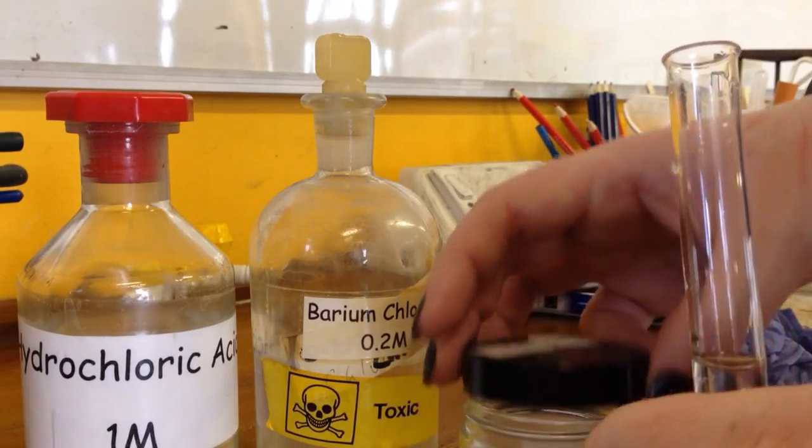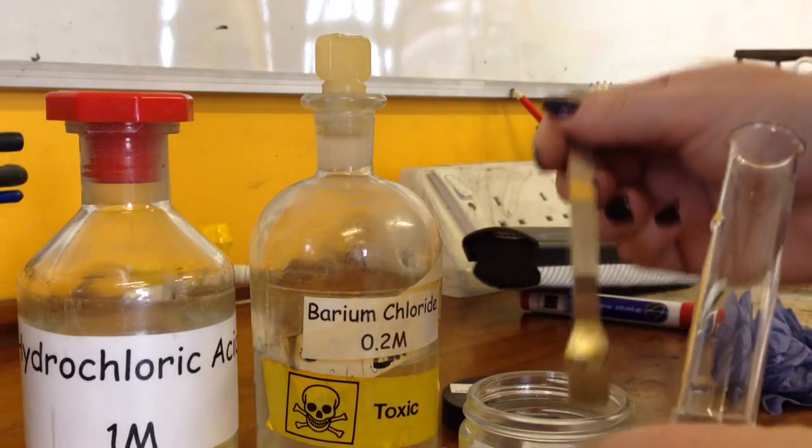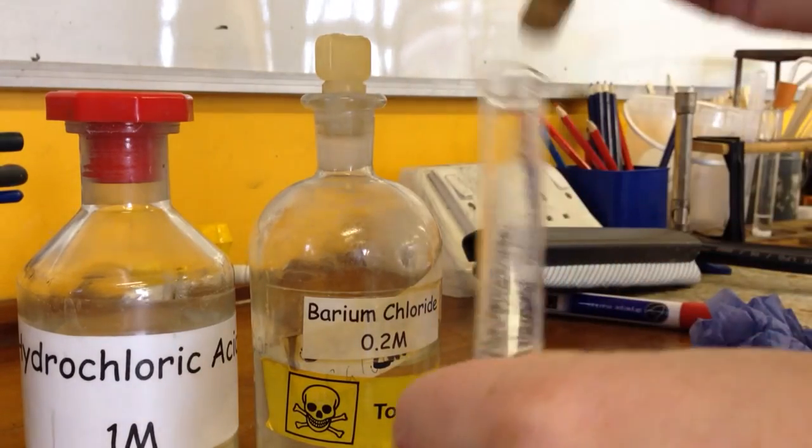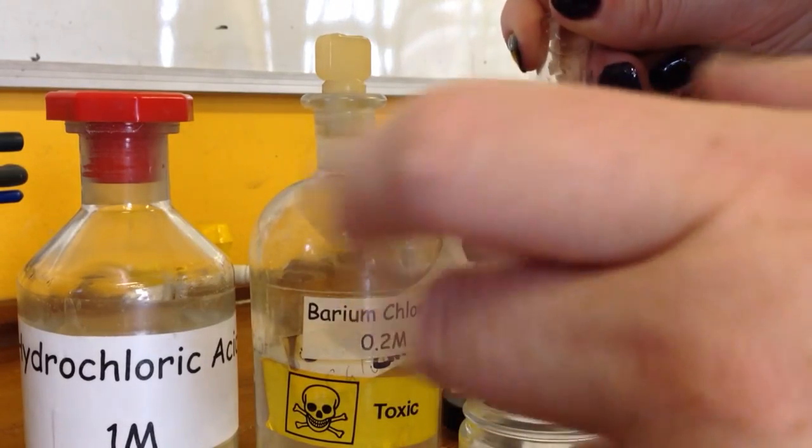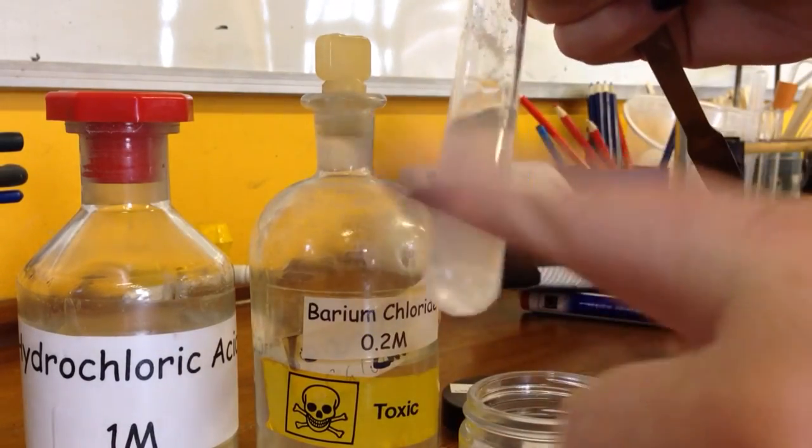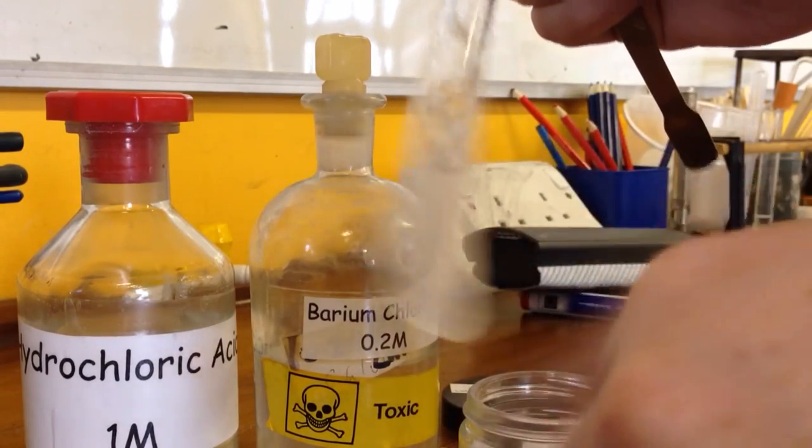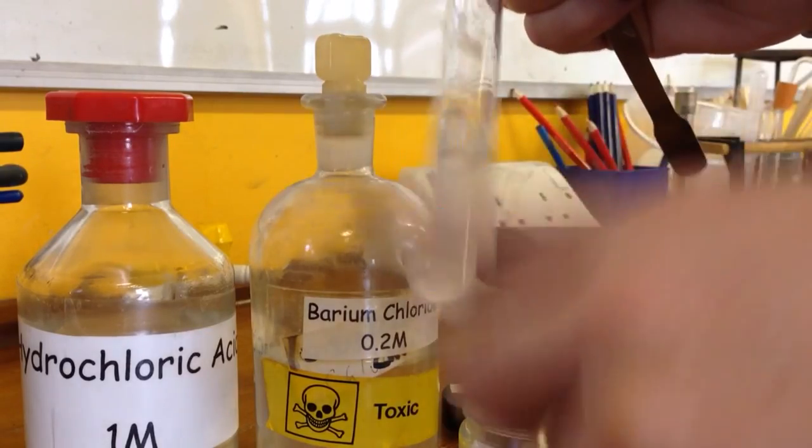I'm going to be testing to see if I have sulphate ions in. So I just need to pop a little bit of my magnesium sulphate into my water and then shake it so it's dissolved.